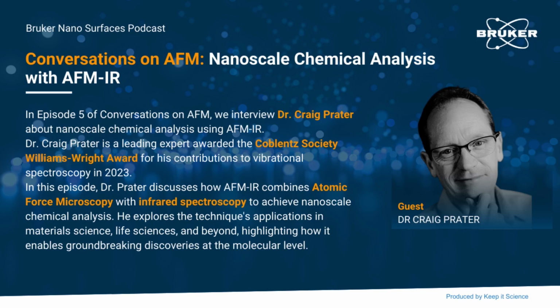nanoscale chemical information with the specificity of infrared spectroscopy. The only problem there was that synchrotrons cost millions and millions of dollars to build, and they're not portable. So that approach wasn't really transferable to other facilities.